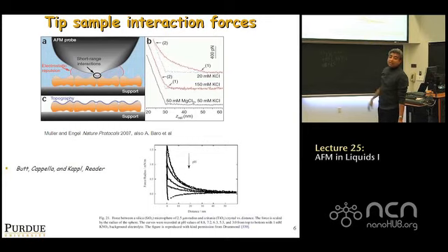So if you as an AFM person are interested in measuring elastic modulus of a sample, you would probably try to use high concentration, because when you try to study mechanical properties in liquids, you need to make sure that only certain kinds of interaction forces are available, not others, right? So it would be hard for you to try and do a Hertz contact if you had the top curve. Then you'd be fitting Hertz to what is really due to electrostatic forces. You see what I'm saying?